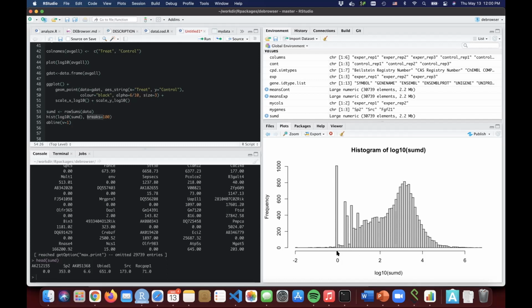So for example, in this case, many of them are around 0, and because this is log scale, there are minus values, and there are some values in between 0 to 1, 2, and you get these kind of numbers. So when you do this, there's a bimodal distribution here. Even some values up to like 1 here, 1 means 10 read counts. So we usually remove those to get a better distribution, because those genes here, there are maybe 20,000 genes total when you look at here, are going to harm your p-value calculations if you don't remove them.